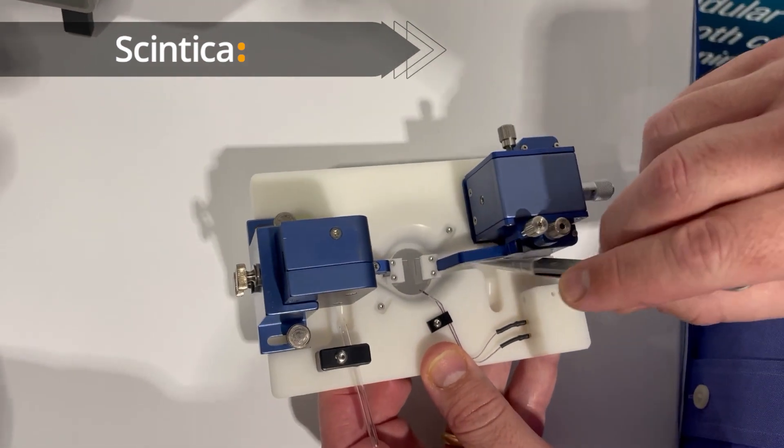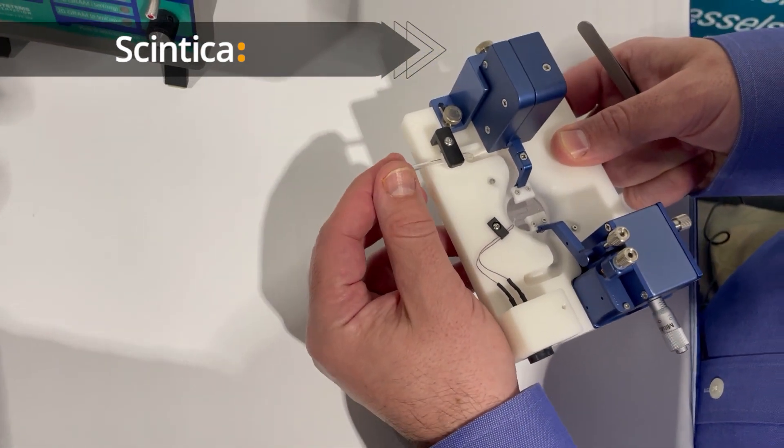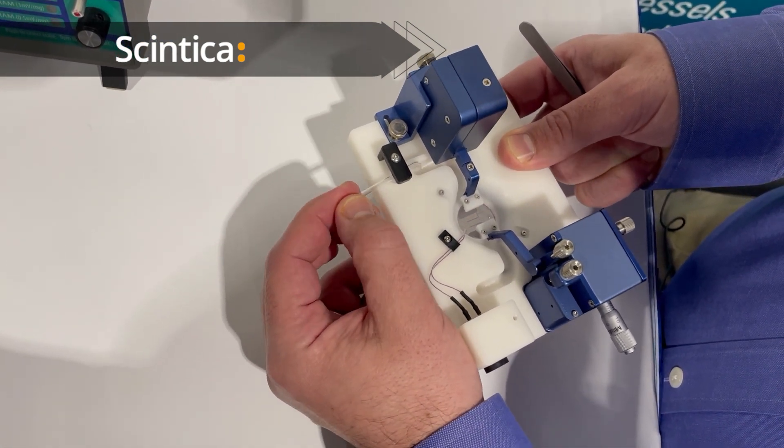It has bath superfusion, inflow, and outflow. The outflow pipe can be raised and lowered to adjust the volume of the saline in the bath.